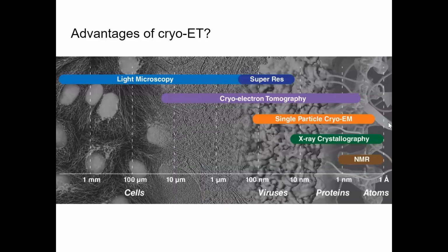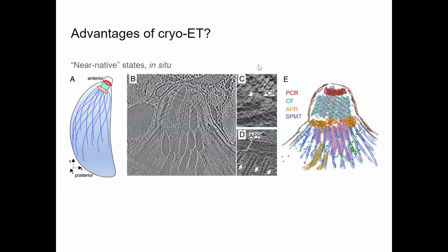However, look at all these other methodologies. What is the advantage of Cryo-E.T? Other methods, like single-particle cryo-EM or X-ray crystallography, can get similar or even better resolutions. However, Cryo-E.T allows for imaging of a more near-native state.